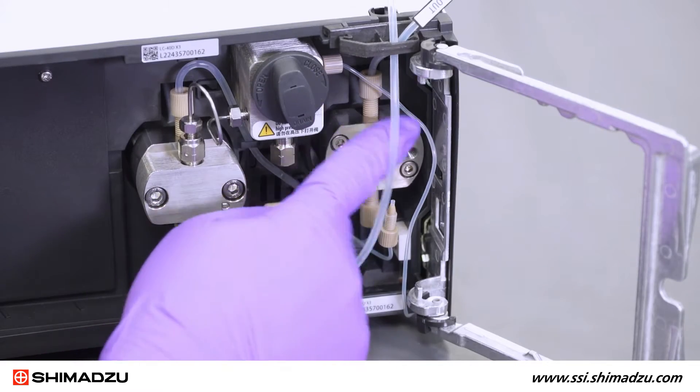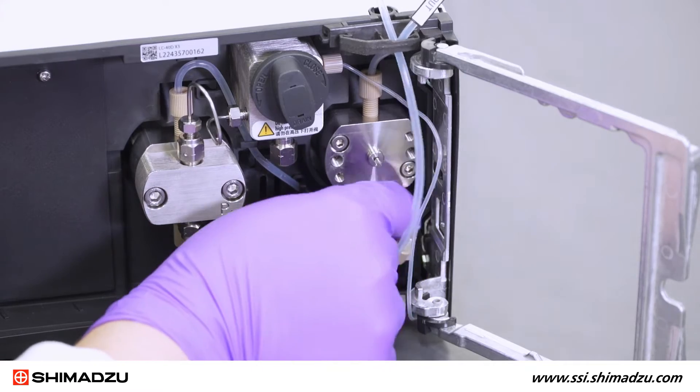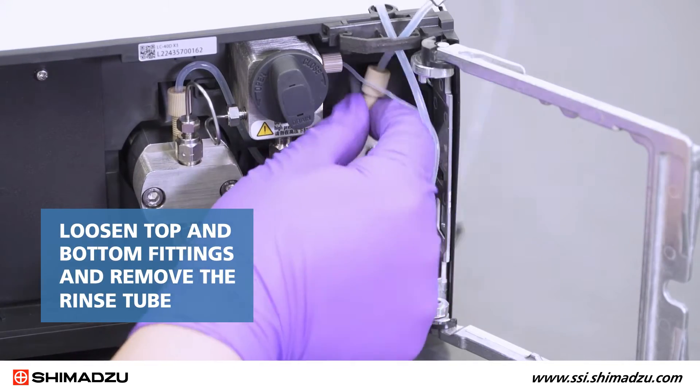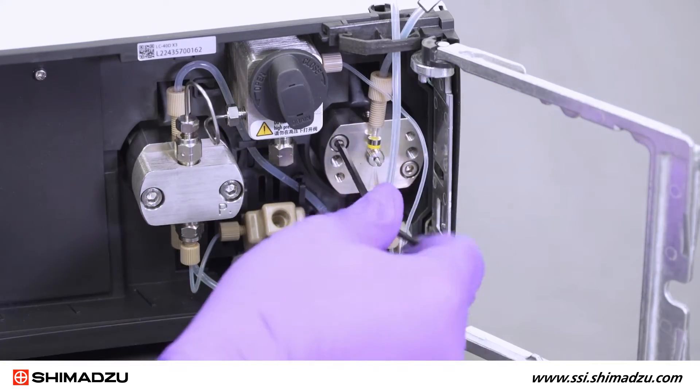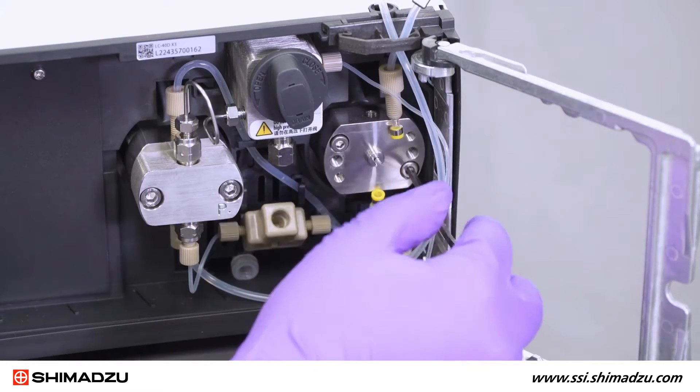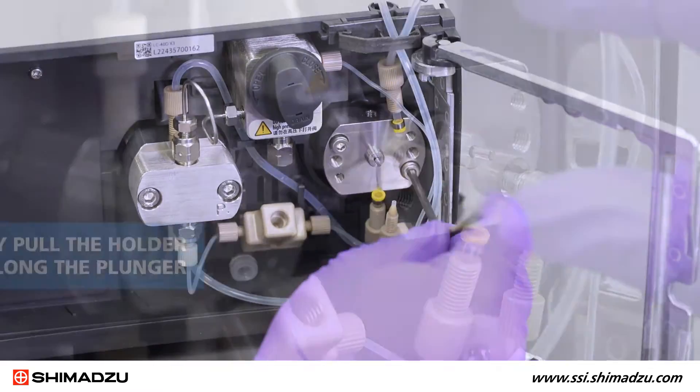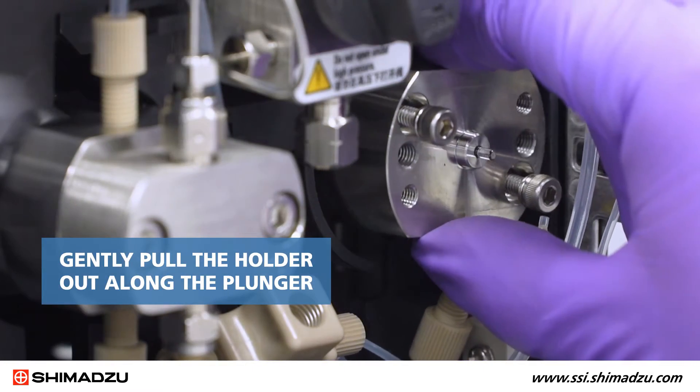Once the pump head has been removed, you must remove the pump head holder. Loosen the top and bottom fittings and remove the rinse tube. Gradually loosen the two hexagonal socket screws of the head holder with the M4 Allen wrench, and then gently pull the holder out along the plunger.